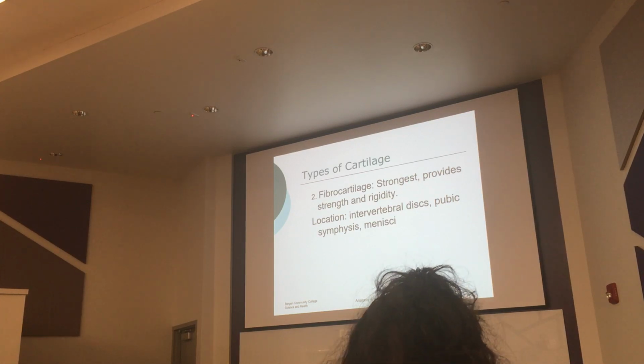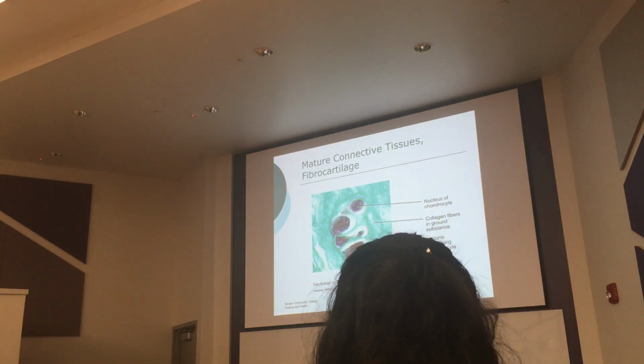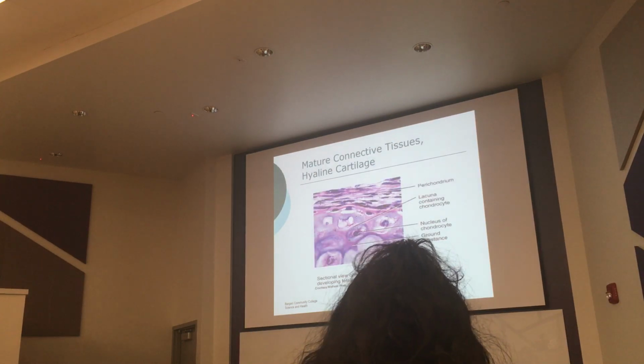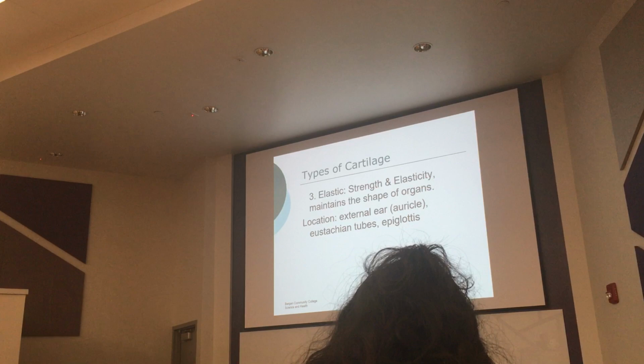And that's what it looks like. Look how thick these fibers are. These are the cells, called chondrocytes, cartilage cells. Look how thick this is compared to these here.